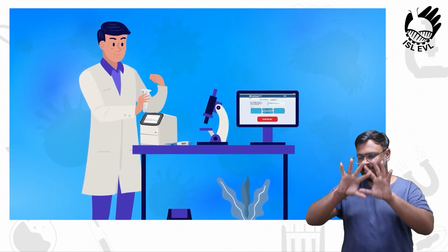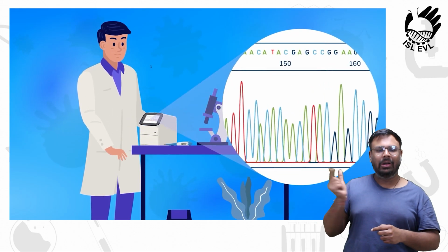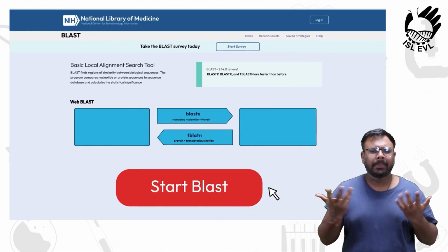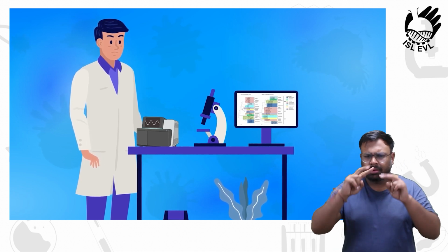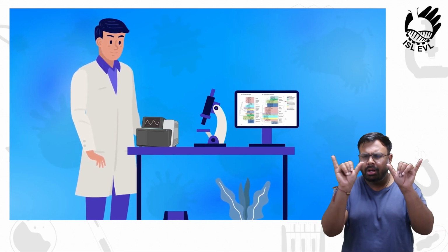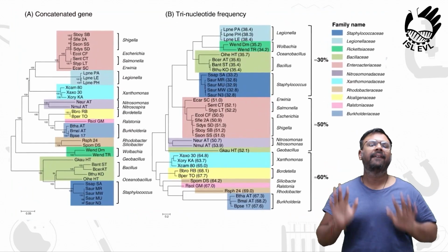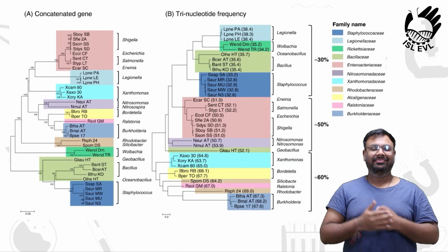Now, amplified DNA strands were subjected to Sanger sequencing, which is a chain termination method that helps in determining the nucleotide sequencing of DNA. Sanger sequencing generates chromatogram. This chromatogram is used to run a blast on the online nucleotide database such as NCBI. Here, our isolated 16S-rRNA gene sequence is compared with the sequences in the database to find the similarity between the nucleotide sequences. Based on this nucleotide similarity, the system will generate a phylogenetic tree which shows how the isolated microbe evolved from a series of common ancestors. Now we get to know what species we had cultured.